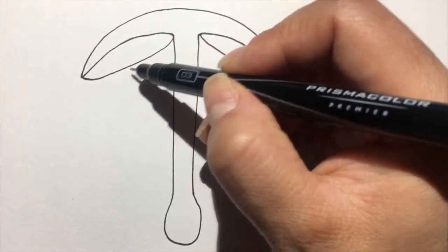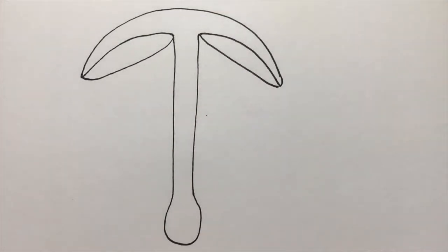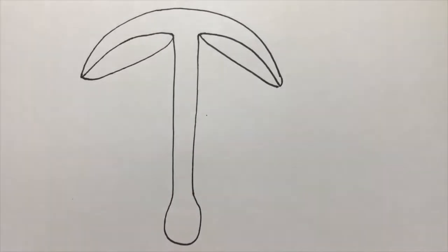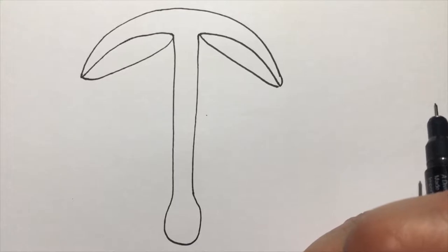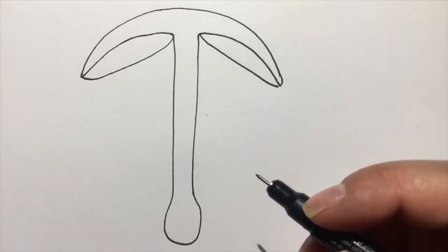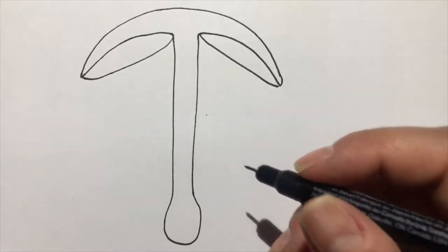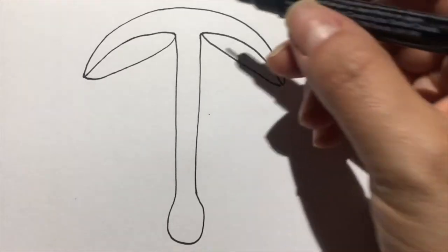and of gill tissue. So to give you an idea of what you would do with an Amanita, once you have the dry specimen, ideally you've cut it in half so you can access different tissues without having to cut the fruiting body when it's dry. Because usually, especially the very delicate fruiting bodies, they sort of fall apart when you try to cut them after they've been dried. So ideally, this is how you start.